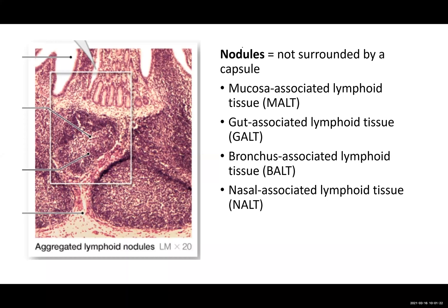What we are looking at right here is our lymph nodule. We can think of this as a collection of lymphocytes. The key thing is that it is not surrounded by a capsule, so it's not something that could be easily dissected and cut out from surrounding tissue. They've outlined it in white, but this particular area is what we are talking about when we say our lymph nodule.